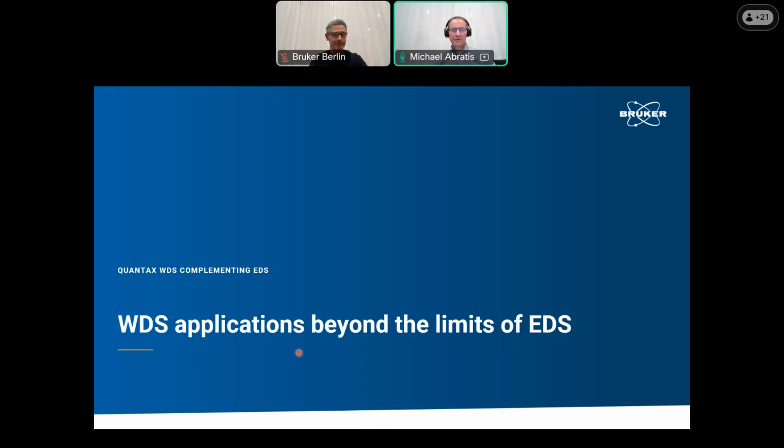Thank you, Stefan, for this very nice introduction. And hello, everyone. I'm happy to have you all here. I'm Michael, and I will show you now some applications that really make a difference. So applications where EDS faces its limits and WDS can surpass these limits.